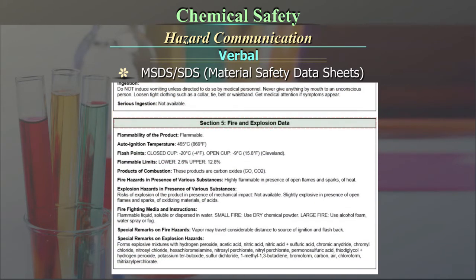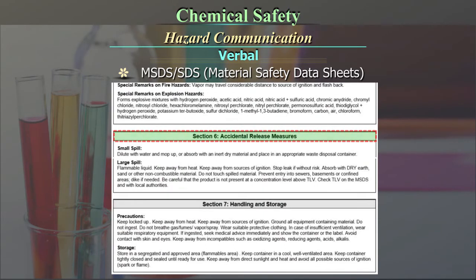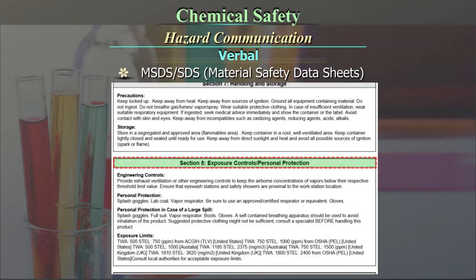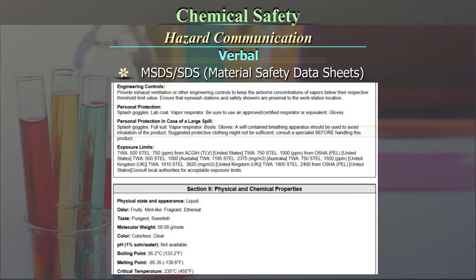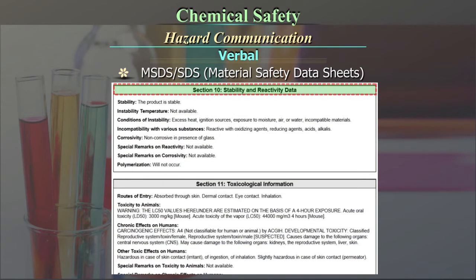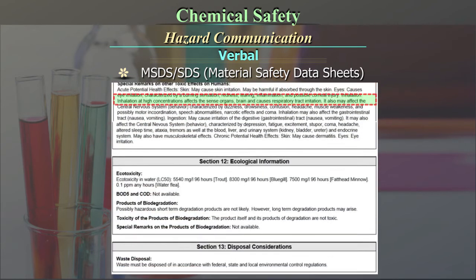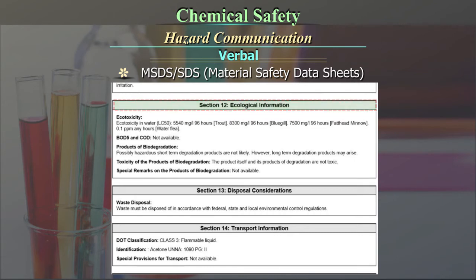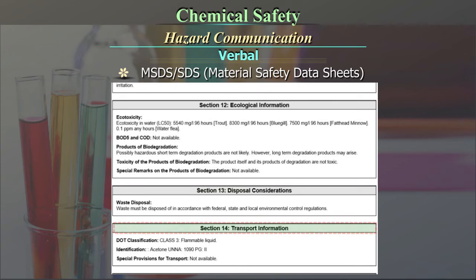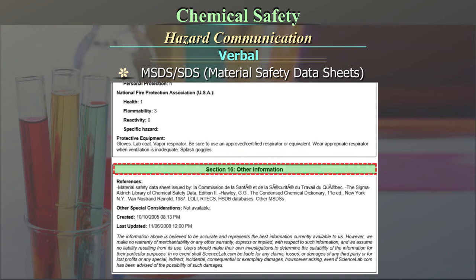Continuing the MSDS sections: (5) Firefighting measures; (6) Accidental release measures; (7) Handling and storage; (8) Exposure controls or personal protection; (9) Physical and chemical properties; (10) Stability and reactivity; (11) Toxicological information; (12) Ecological information; (13) Disposal considerations; (14) Transport information; (15) Regulatory information; (16) Other information.